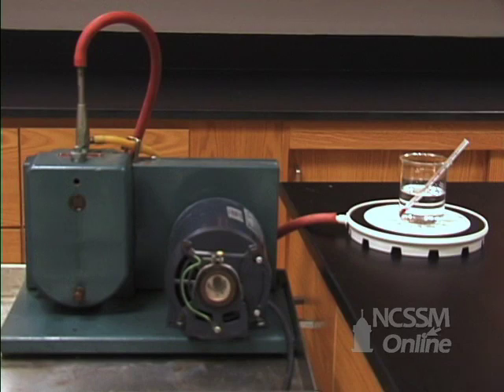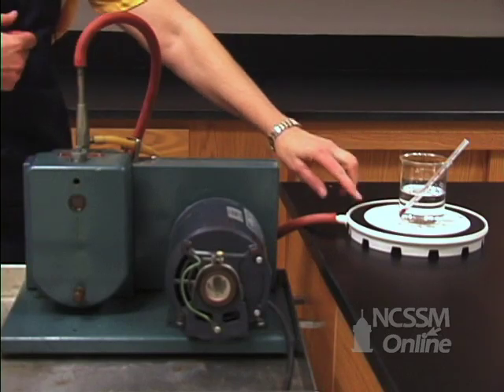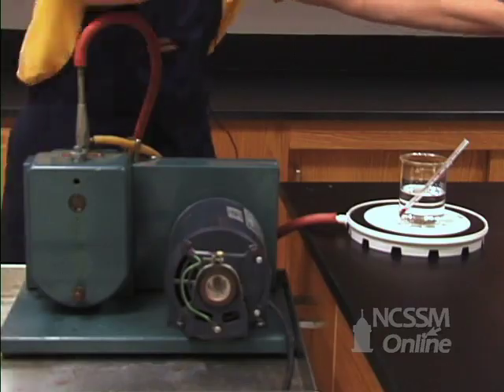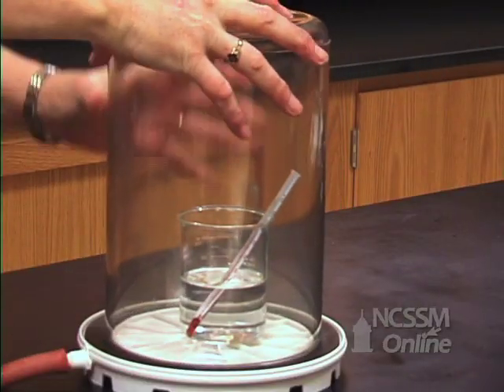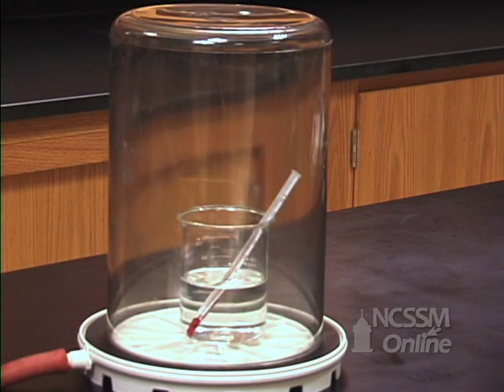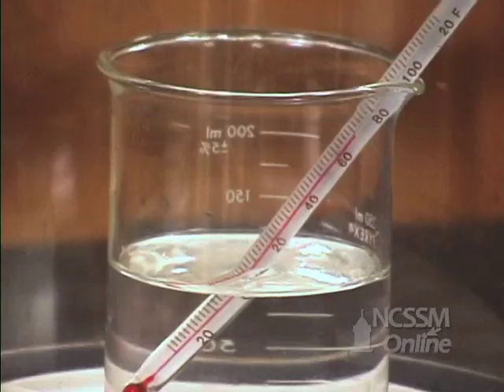We're going to look at the effect of pressure on the vapor pressure of water. Remember, a vacuum pump is an instrument that will remove gases. Here you have the O-ring that's going to make a seal. We have water with a thermometer. We're going to make a closed system. When we turn the vacuum pump on, it's going to take gas molecules out of the container through this tube right here.